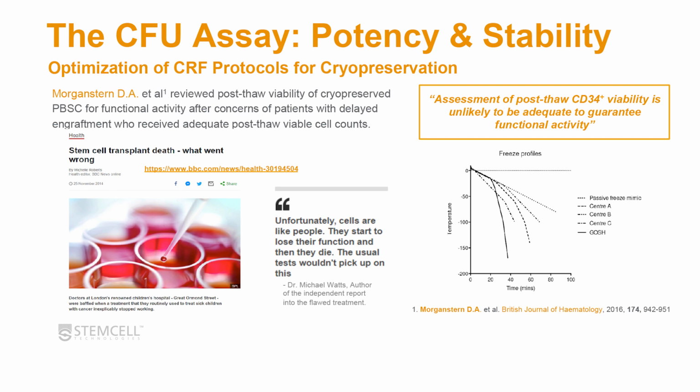So there was actually an investigation that was started because of this, and this outlines what happened as far as the BBC news that came out on this incident. And Dr. Mike Watts, again, was involved in investigating this and did an independent investigation and a publication to show that the assessment of post-thaw CD34 viability is unlikely to be adequate to guarantee functional activity.